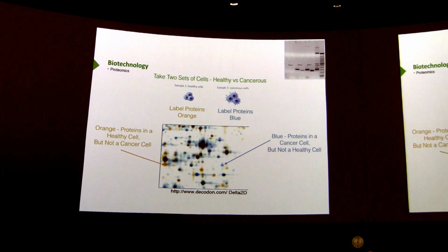So that's the good thing, is that you can say, okay, well, if I now know where, for example, that DNA polymerase is on here, then everything else will orient relative to that. I could say, well, above that's going to be this, and over to this side is going to be that. So it's a relative thing, but I still get reproducible separations. Yes?